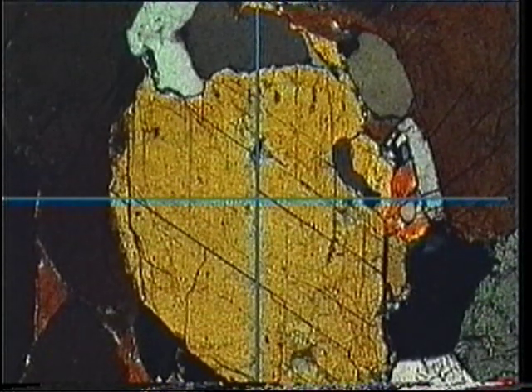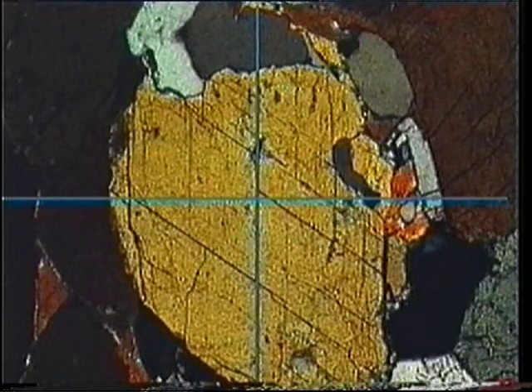Returning to the grain with two sets of cleavage traces, note that each set is sharply defined. Thus, this grain is cut at right angles to the cleavages and the C-axis.